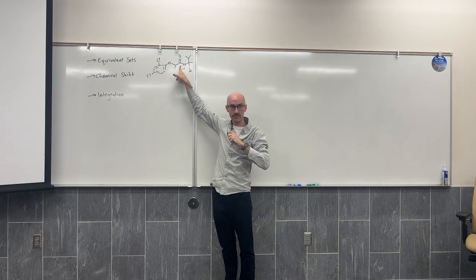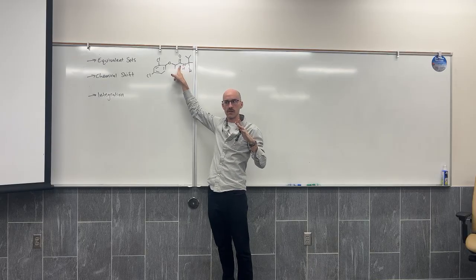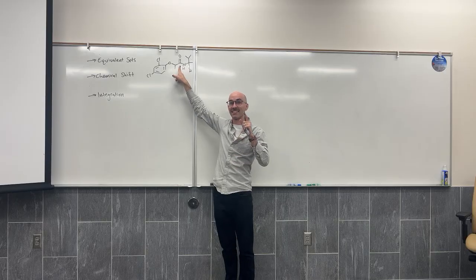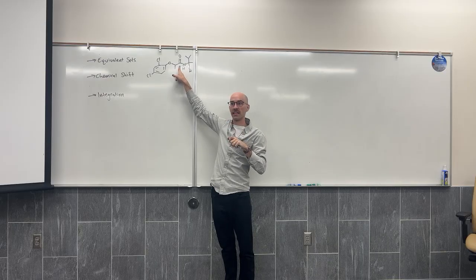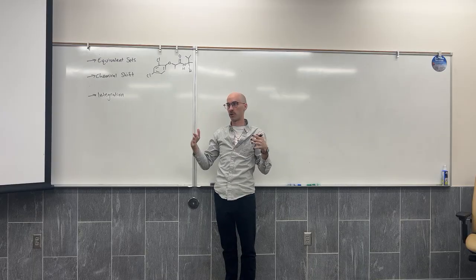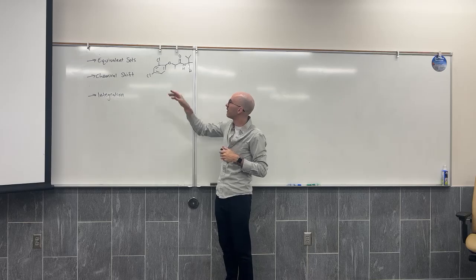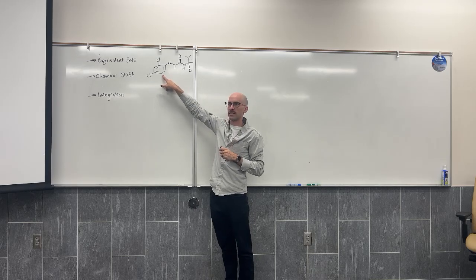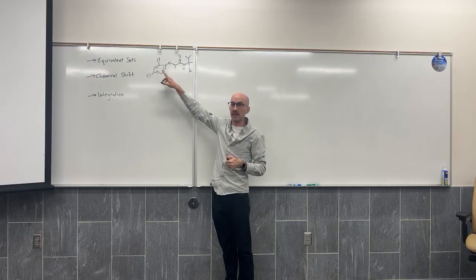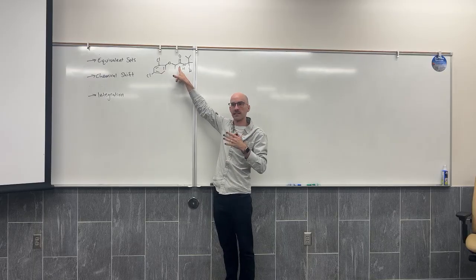This is an amide. Amide, either one. But carbonyl means? It's a specific type of double bond. CO double bond is a carbonyl. And this carbonyl is an amide. Carbonyl is not a functional group. Carbonyl is a class of functional groups. It's like how hydrocarbon, if you had said, oh, there's an aromatic ring, is it a hydrocarbon? Yes, it is, but more specifically, it's the aromatic ring. Is this a carbonyl? Yes, but more specifically, it's the amide.